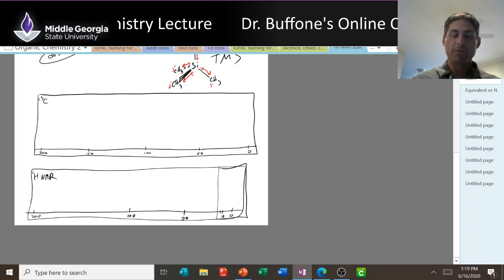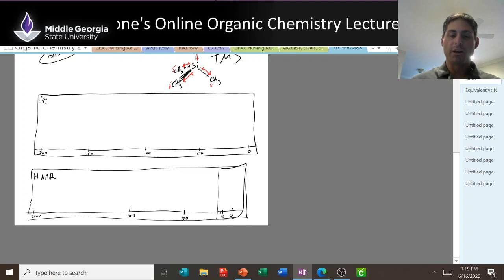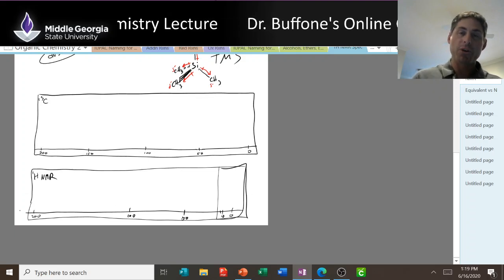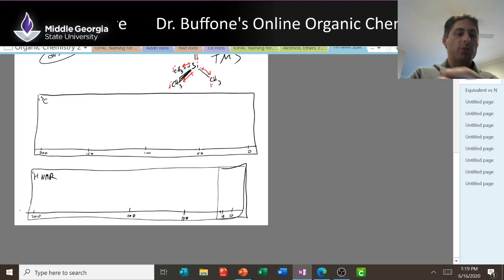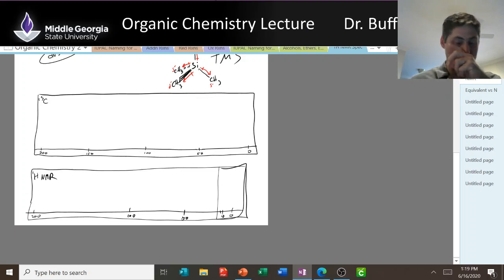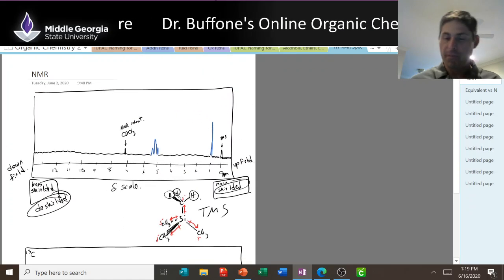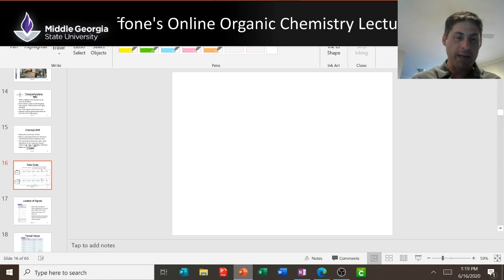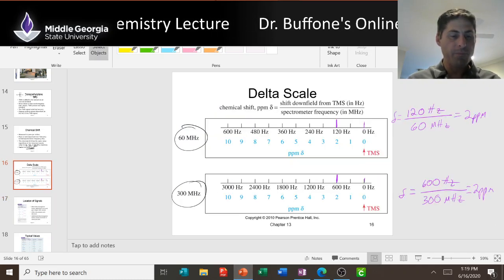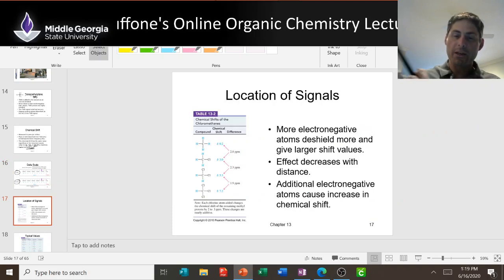This is the normal range of a proton NMR spectrum if the compound is diamagnetic. If it's paramagnetic in proton NMR, you can go out to 200. For C13 in a normal diamagnetic compound, normal is between 0 and 200. And it has to do with the difference between protons and C13s. So just a look ahead, something that we're going to actually see. Let me see, here we go. So location of signals has a lot to do with shielding. So take a look at these molecules here.